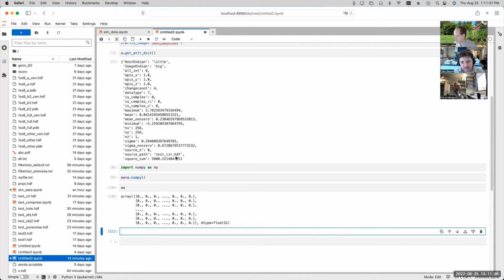Yeah, it's kind of confusing because I can take the TIFF stack and run it through MotionCor, and then I get my dose weighted and my non-dose weighted, and then you sort of got to figure out the track for each of those outcomes, get them into HDF and bit truncate them, but then you're just swapping them around constantly. And it'd be real nice to have one HDF file with all of that information. You mean with both types of images in the same file? Yeah.